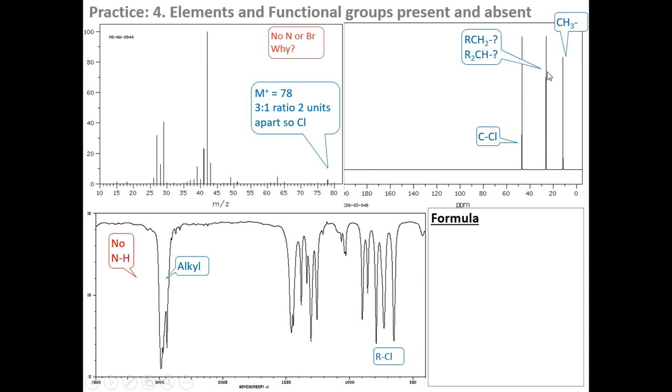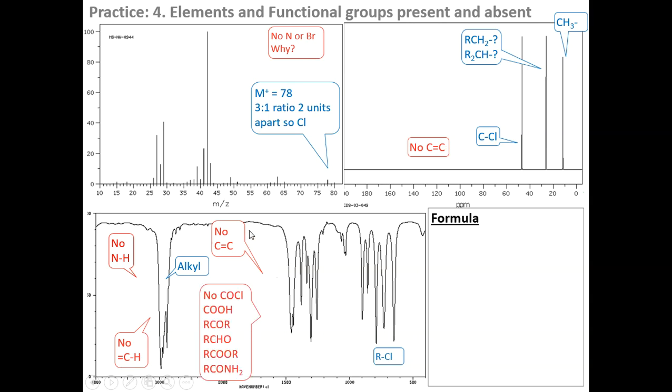So again, alkyl, that matches up, and then we know very clearly that there is no alkene present because of the lack of peaks in the required areas. Spell out those areas you expect to see them. Again, we see there's no carbonyl, so all of these functional groups are absent, which is supported in the NMR. Spell out the area where you would expect to find those peaks.